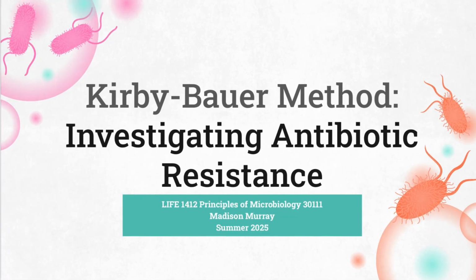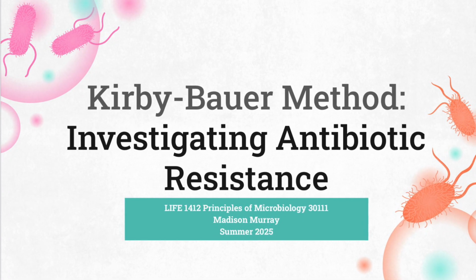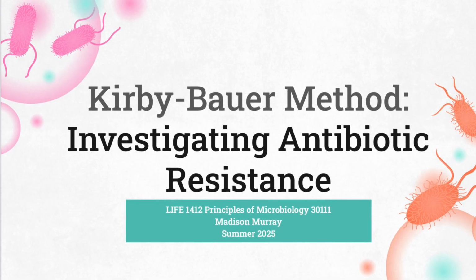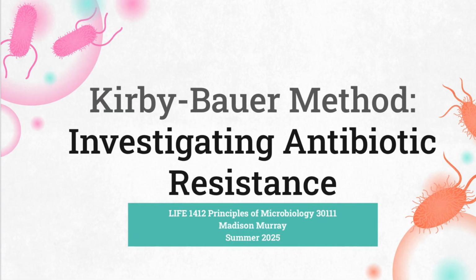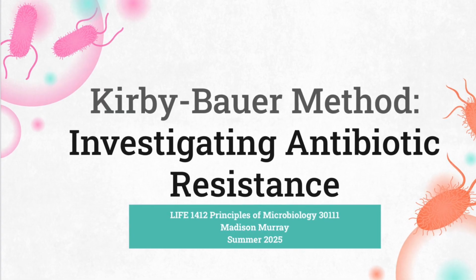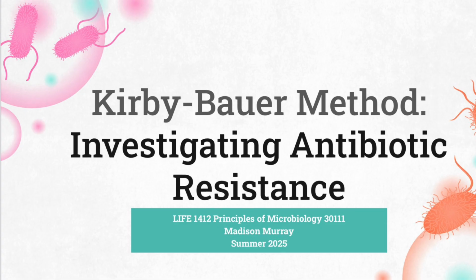Hi everyone, my name is Madison Murray, and today I'll be walking you through my microbiology lab, investigating antibiotic resistance using the Kirby-Bauer method. This is one of the most widely used techniques in clinical microbiology, and it gave me some really eye-opening insights into how bacteria respond to antibiotics.